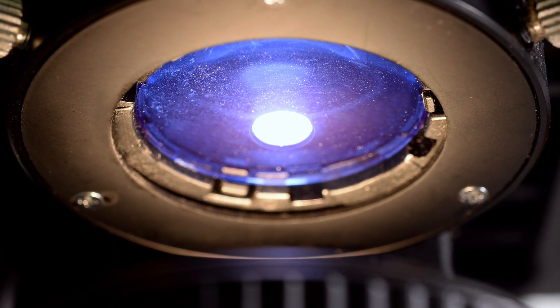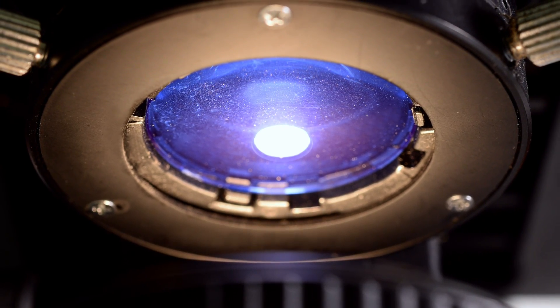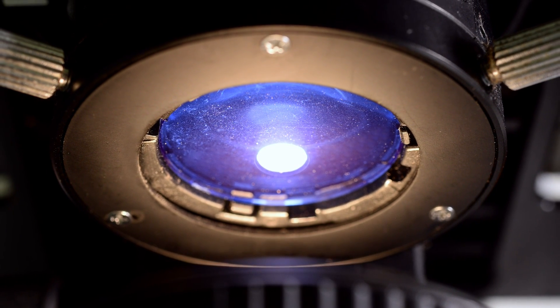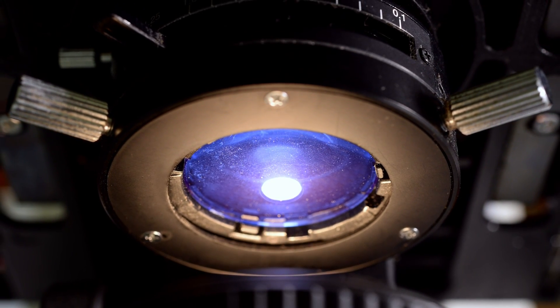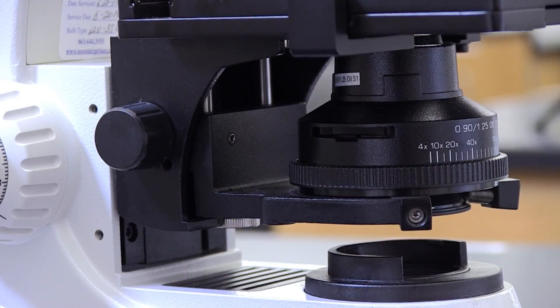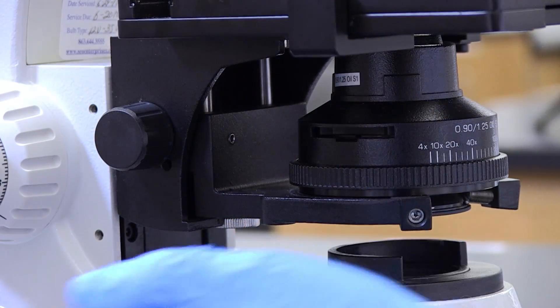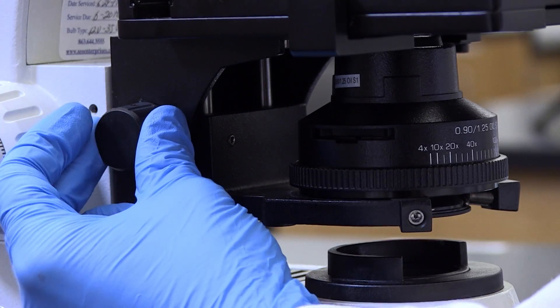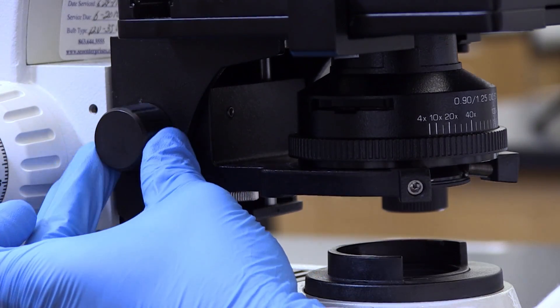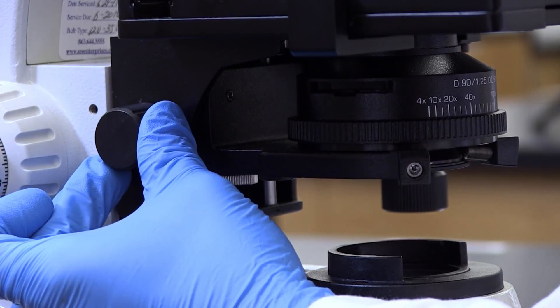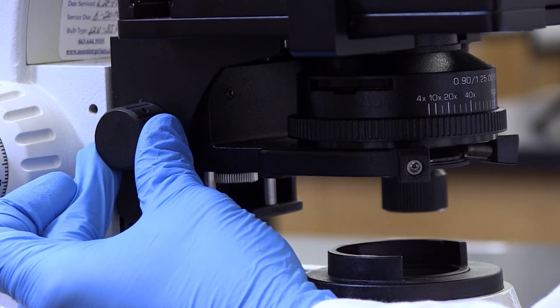Condenser lens, the first lens system of the light microscope, is located beneath the stage and is usually contained in the same housing as the iris diaphragm. The condenser collects and focuses light on the specimen being studied. Although the condenser can be raised or lowered, best results will be obtained when the condenser is kept at its highest point, just below the level of the stage.